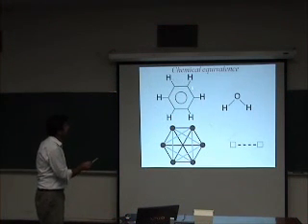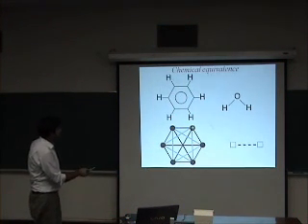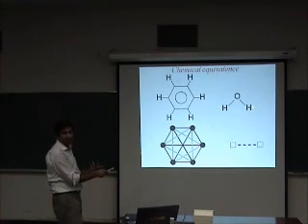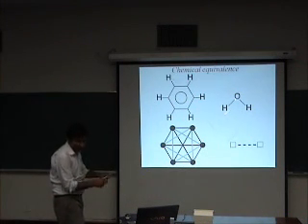Likewise, in benzene, you have the 6 protons, and you can draw this icon for the molecule. The 6 protons, all of them have the same frequency. In water, the 2 protons have the same frequency. So the protons are chemically equivalent. You will get just one chemical shift.